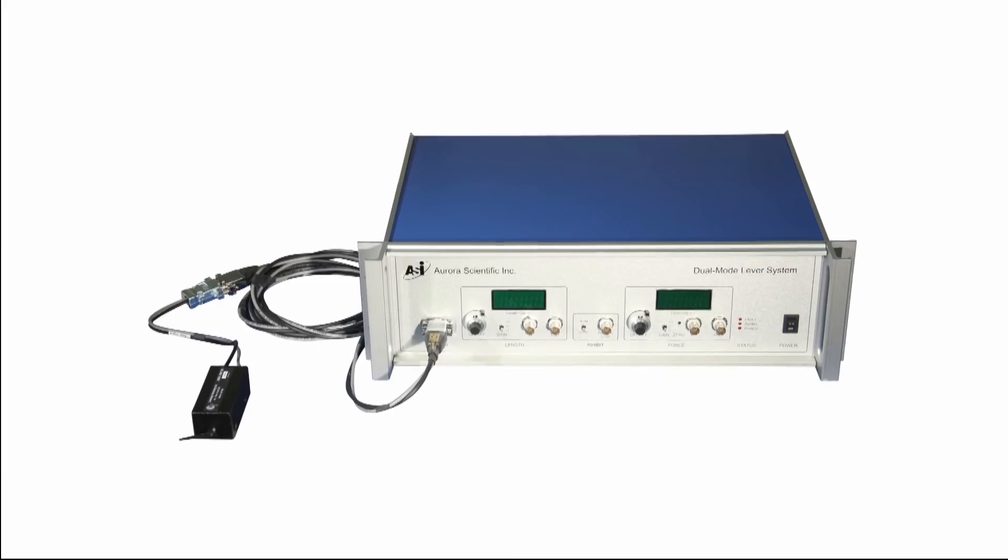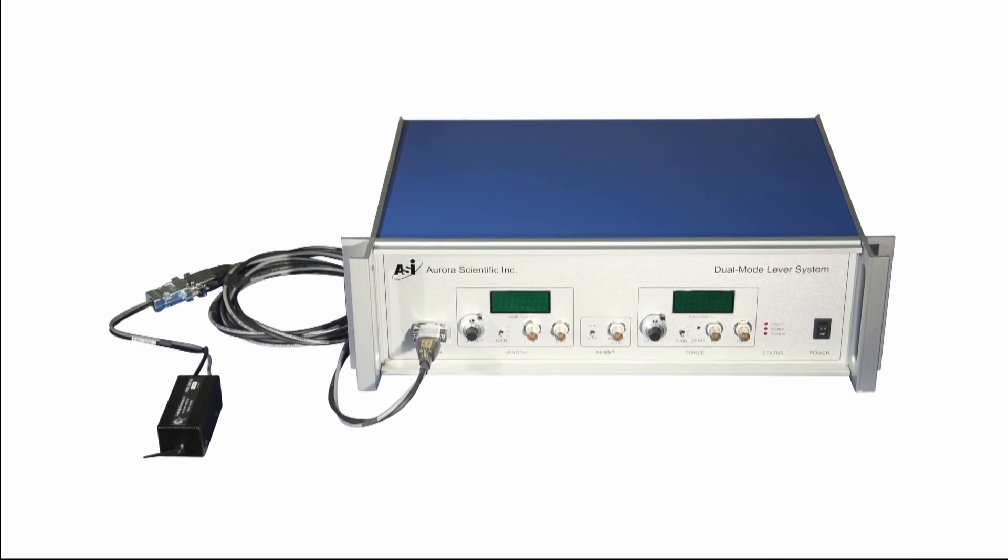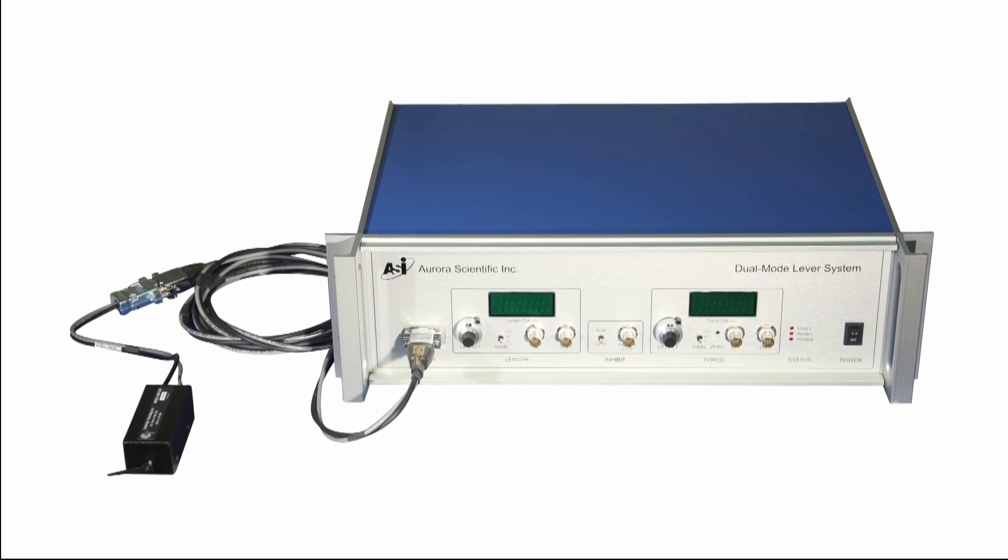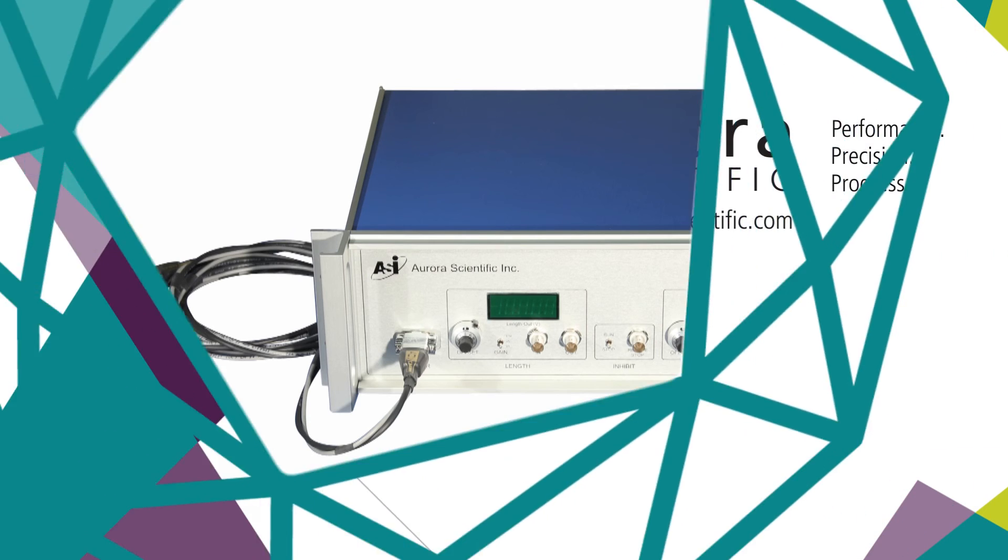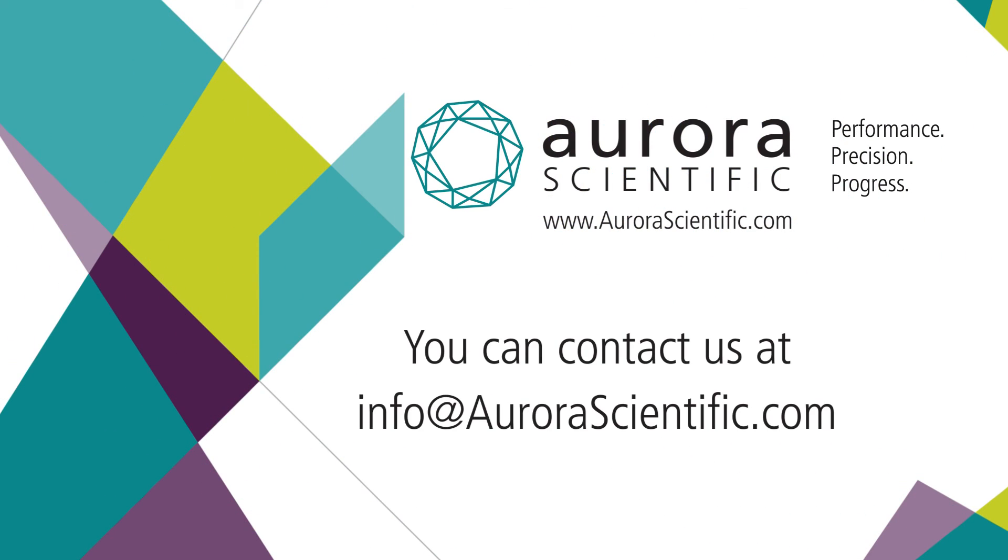You are now ready to integrate your dual mode lever system into the rest of your experimental setup. Please refer to our other setup and introductory videos for further information.